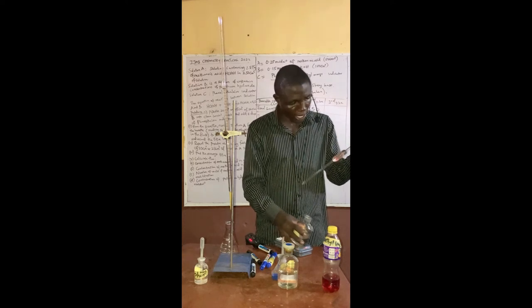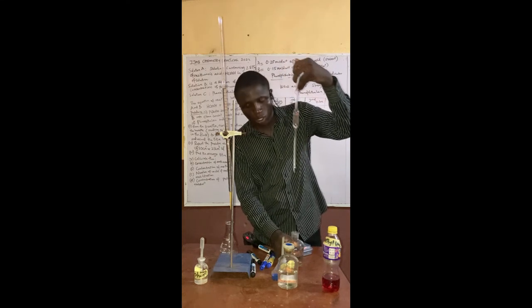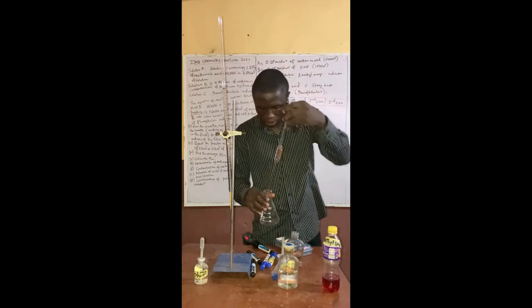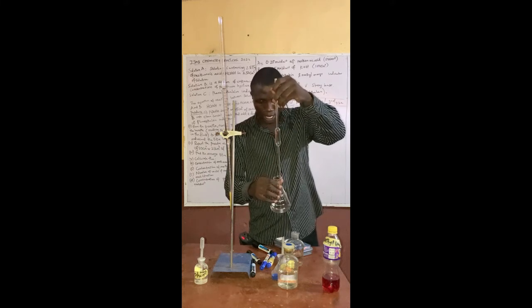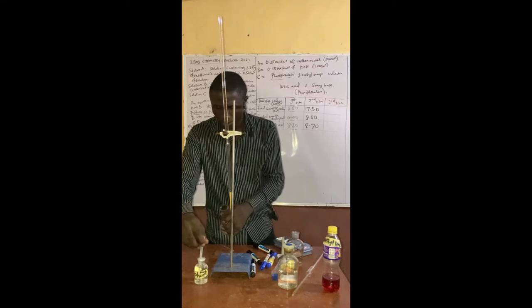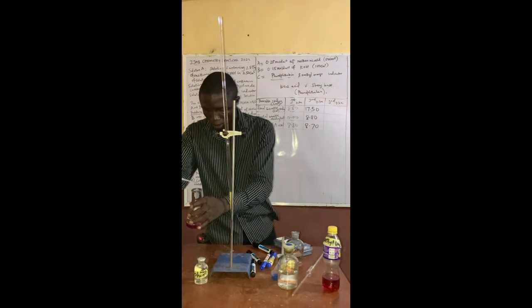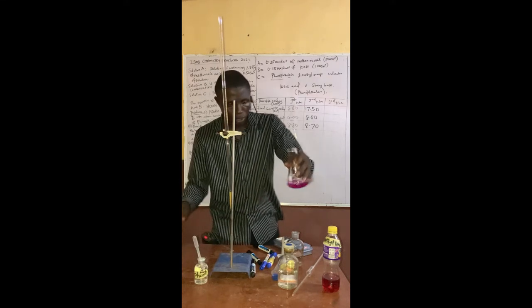So this is exactly what? So if I try to key, you put it there, then add your phenolphthalein. Add your phenolphthalein. 2 drops. 1, 2. So this is 2 drops now.